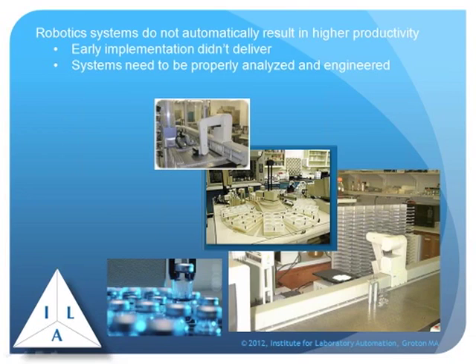The reason for it was the people that engineered the systems, that put the systems in place, thought, well, the analyst does the process this way. We'll make the robot do the same thing. So instead of a human being walking up and down the lab bench, the robot did it. Or instead of somebody going up and picking up tubes, the robot would go off and do that. So the amount of time that things took was about the same. We didn't get faster throughput. We just offloaded people a bit.